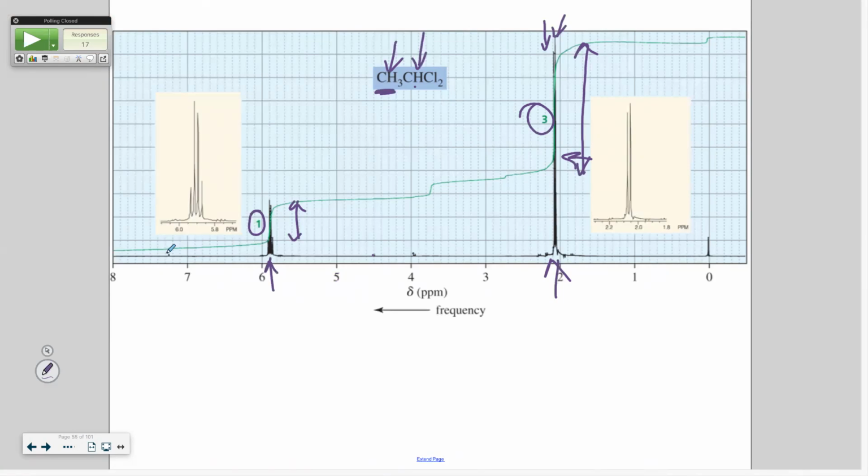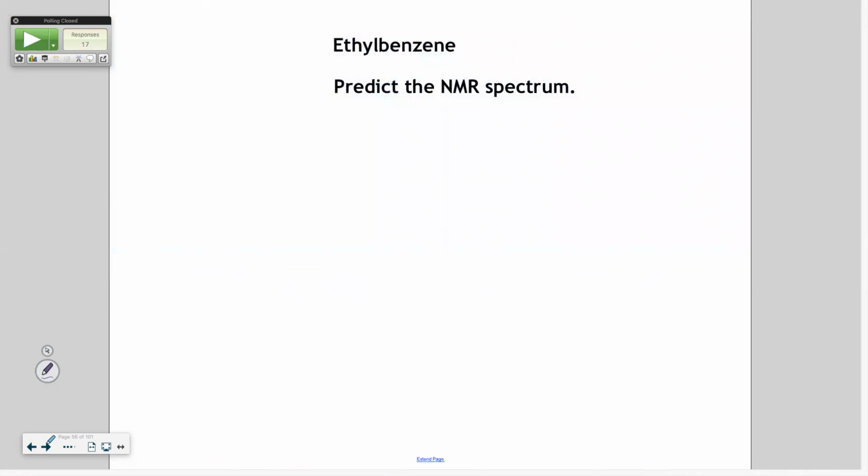Look and see if there is solvent in there from when you recrystallize something. That's a common thing that I'll see. Or maybe there's a little starting material mixed in there. You didn't get them separated out really good when you purified. Those would be things to look for.